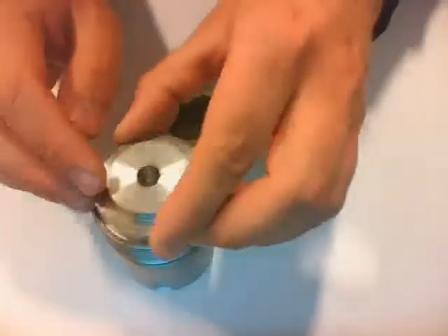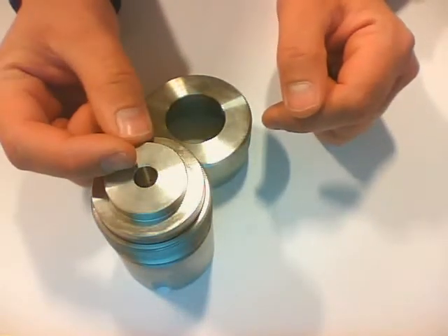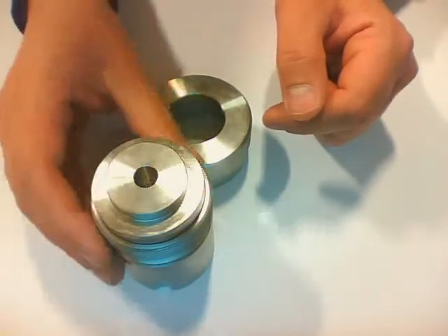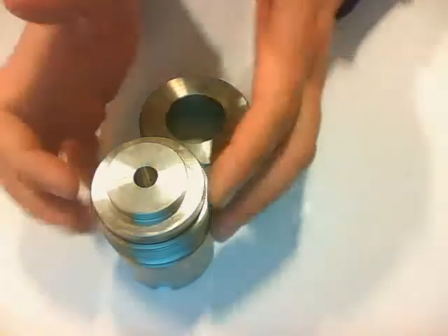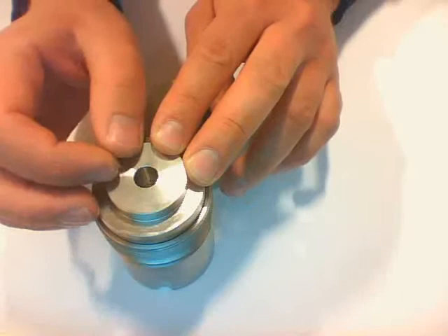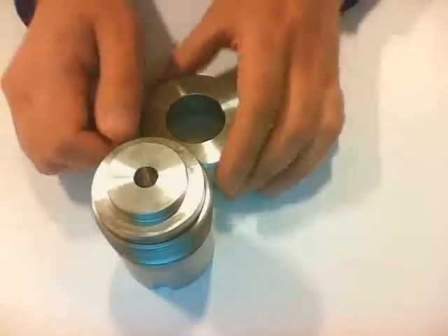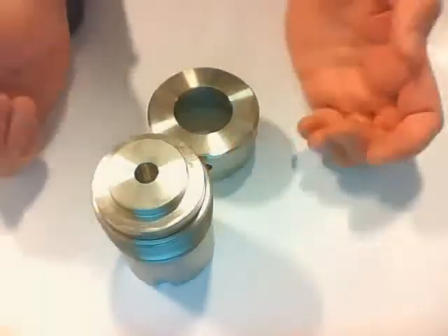The lid insert has a hole, and through this hole the teflon will actually be pushed if the pressure inside gets too high. So if the pressure inside the body gets too high, the burst diaphragm will break, the teflon will go through this hole, and the pressure will be reduced so that no explosion will take place.